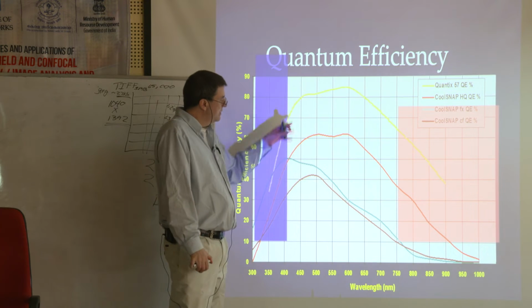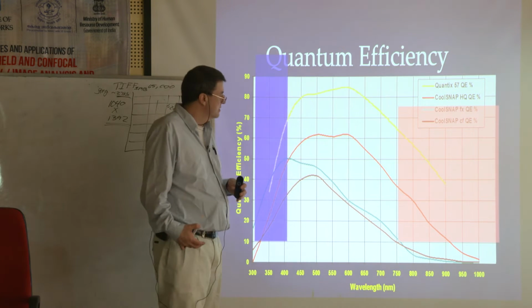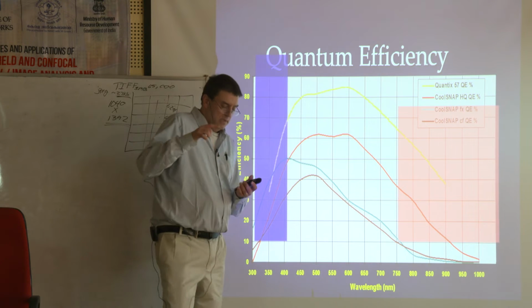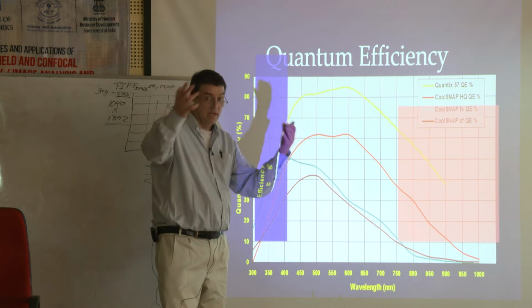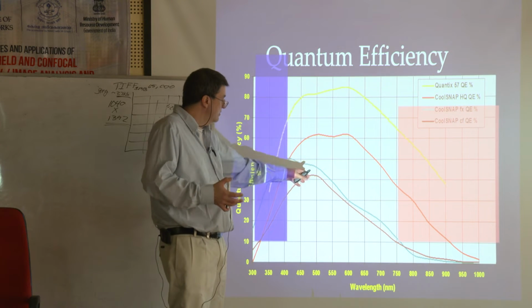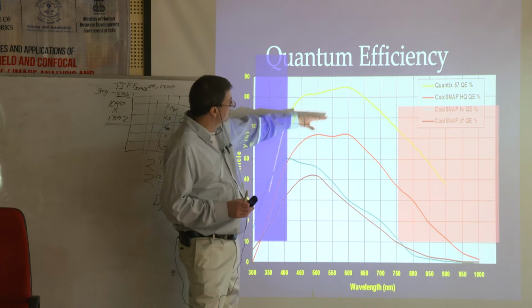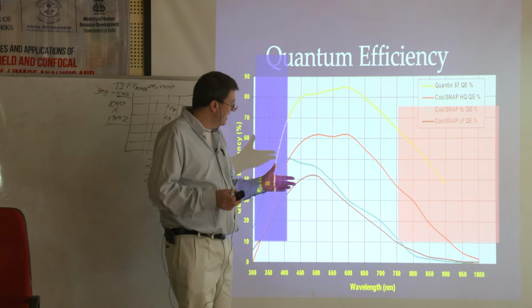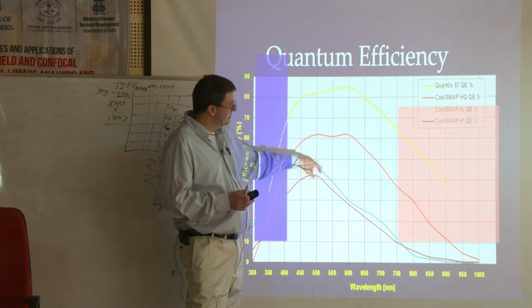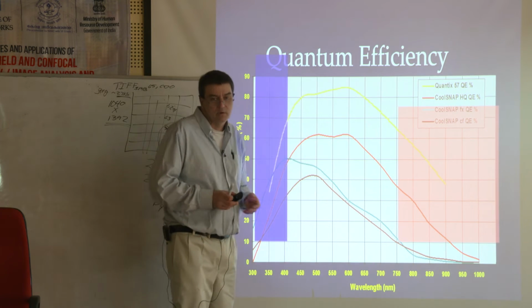Okay. So depending on the application, when I was in imaging sales, I sold digital cameras. The question always was, do you want to go fast? You know, what's your application? Do you need to get a lot of light in? Or are you just doing basic laboratory stuff? This kind of stuff here is more specialized techniques, whereas here's the more normal stuff. My cameras basically fall in between these two, because I don't do anything that crazy. If I do, I have to go find another camera to work with.